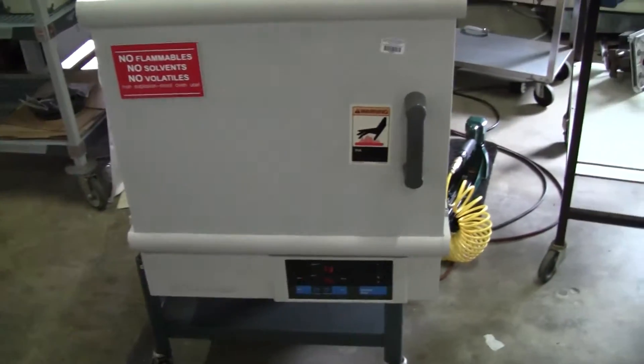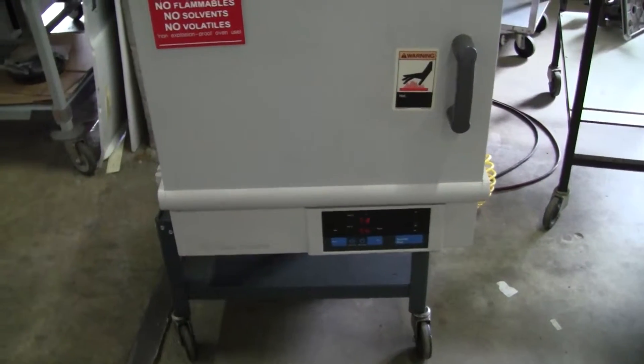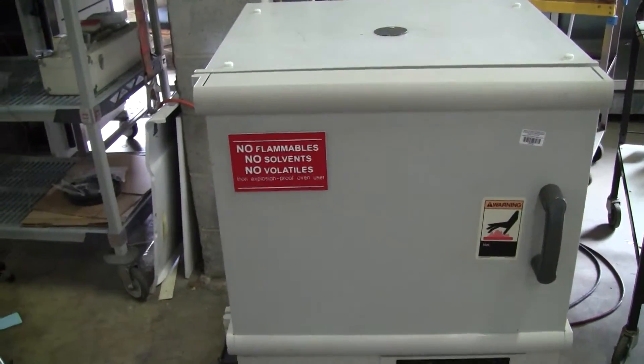Hi, this is Michael Natale from High Tech Trader. Today we're looking at a Fisher Scientific Mechanical Convection Oven. As it says: no flammables, no solvents, no volatiles.